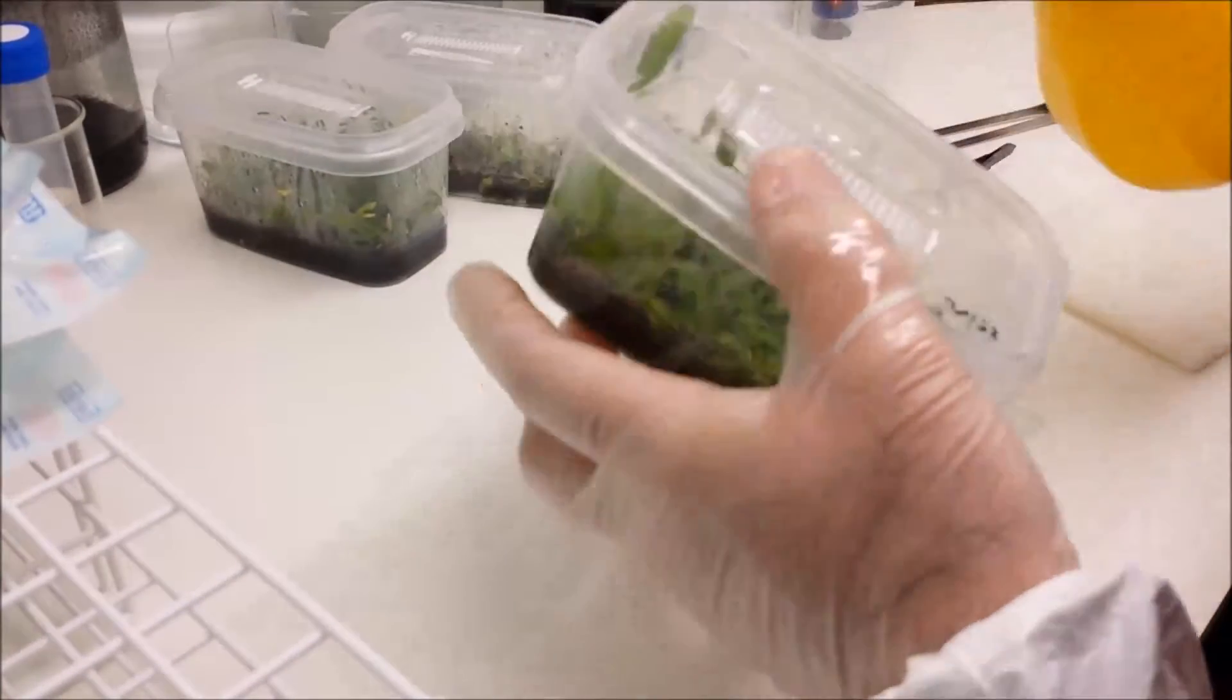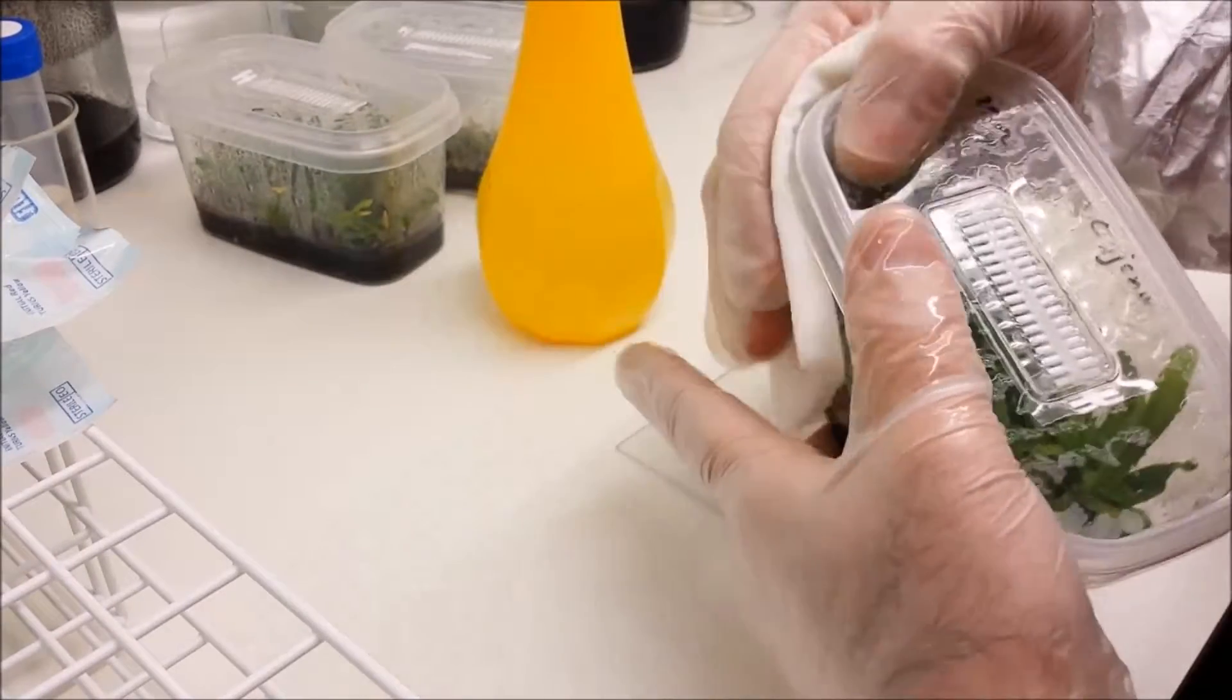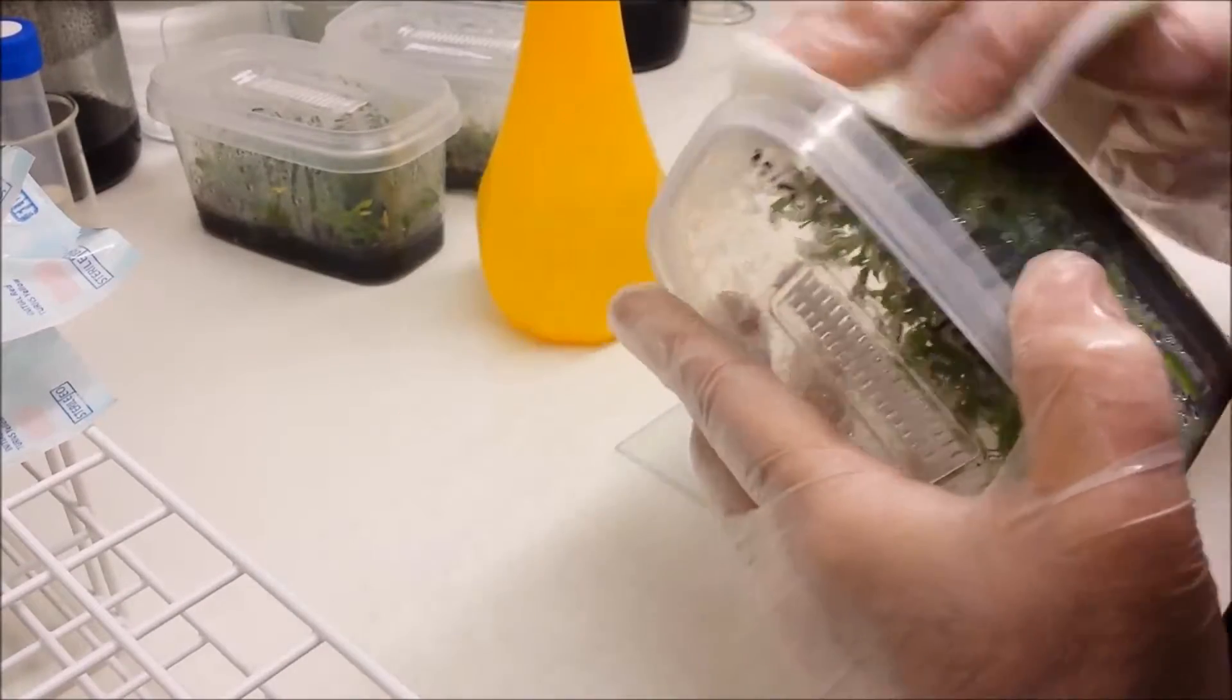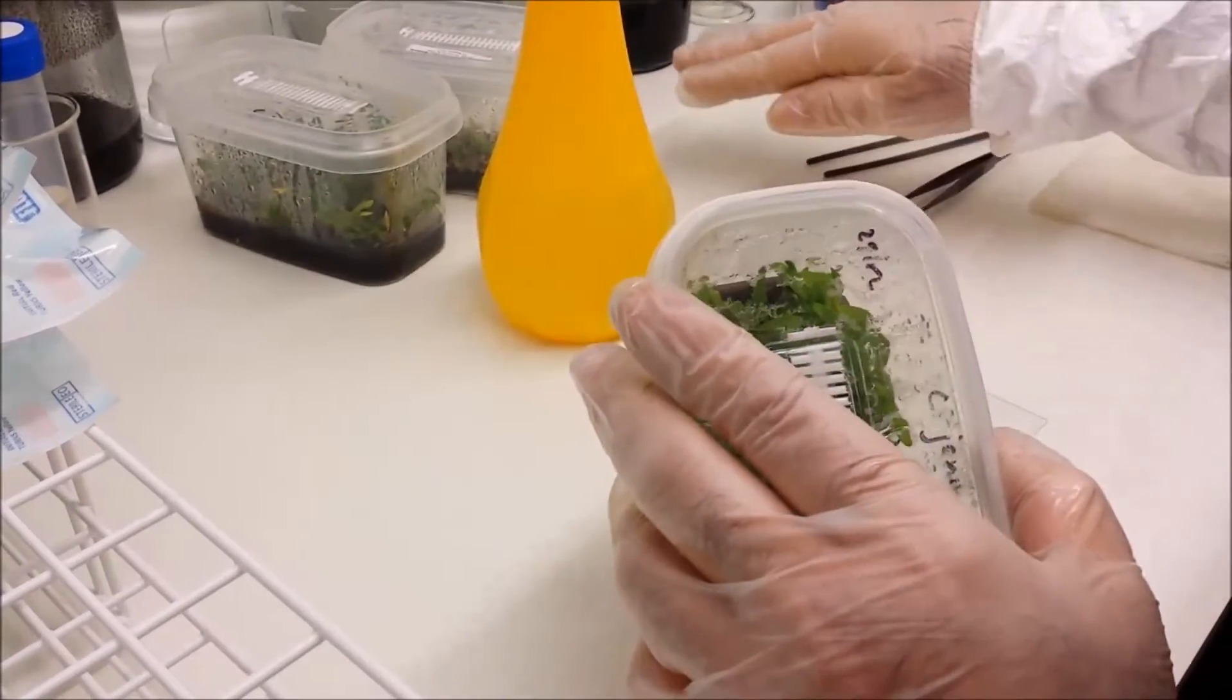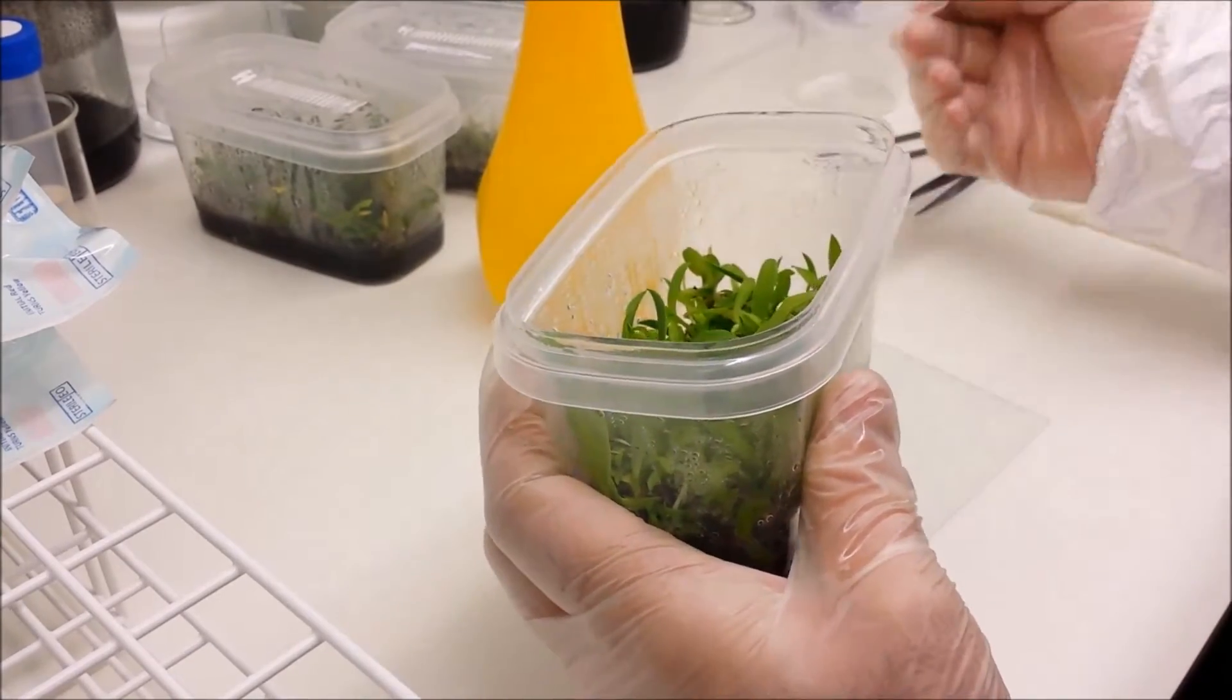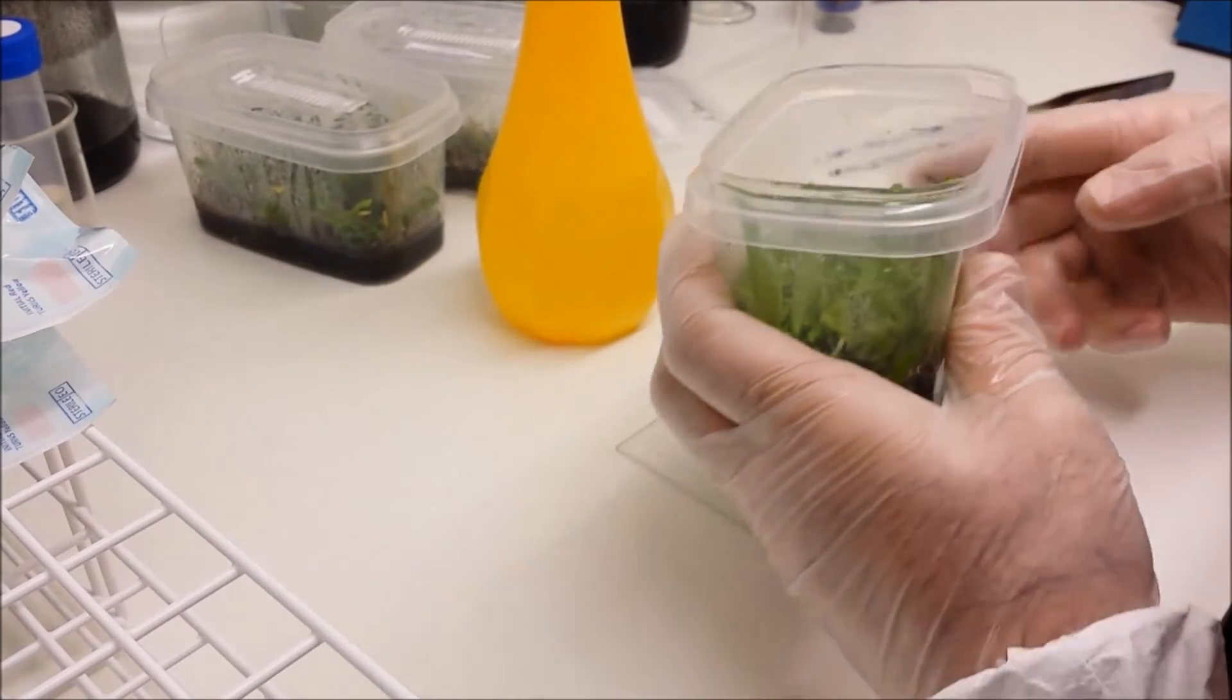Now although I've already sterilized these tubs, I'm going to do it again just to remind you. And I've sprayed it all over with IPA and I'm wiping it down including the base underneath. Don't forget that. And you're going to be removing the lid and placing it inside facing upwards, so not on the surface, in the sterile area away from where you're working.